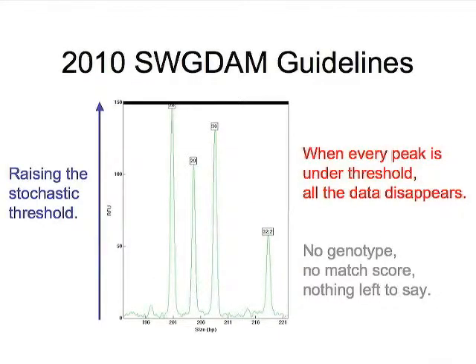That was at a threshold of 50 RFU. When you use stochastic thresholds and raise the level to 150 or 200 RFU, the peaks that are under threshold begin to disappear from your review — as do the criminals you're trying to detect and identify. The result is there's no genotype, no match score, and really nothing left to say to police, prosecutors, or society, because the data is now invisible to the interpretation method. It's there, but you're not seeing it with thresholds.